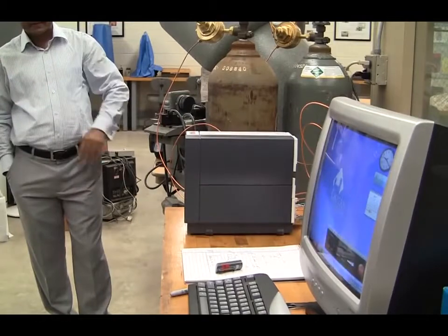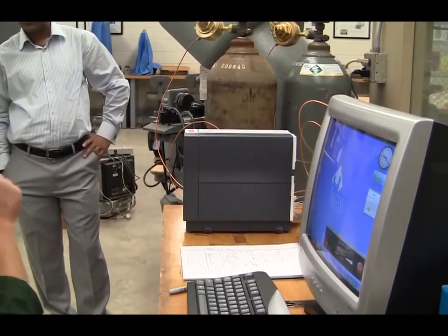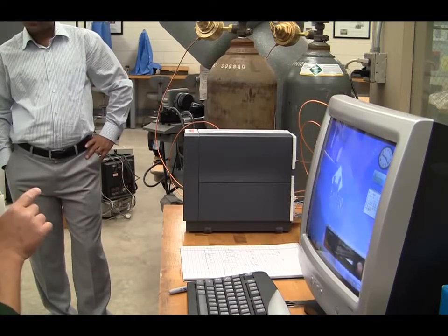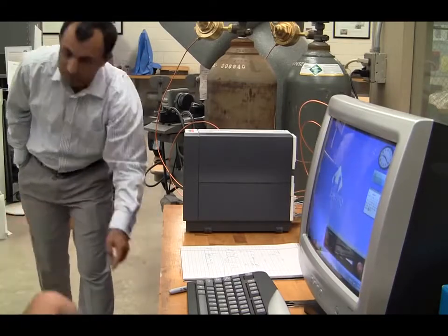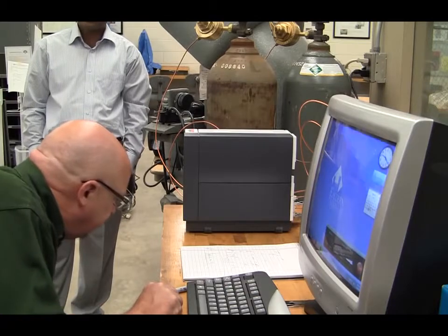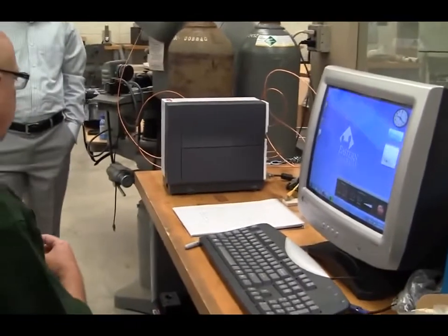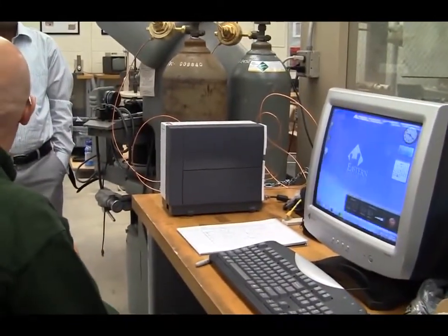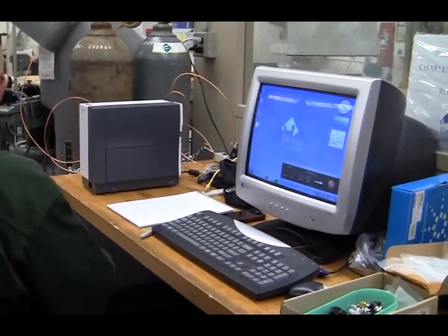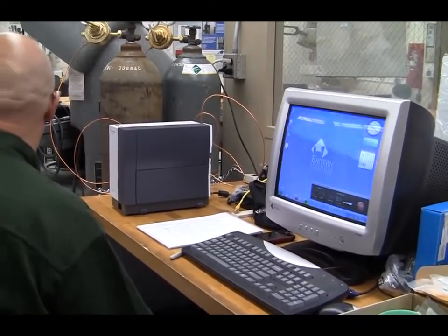So we wait for it to come back to ready. First thing it's going to do is go through the startup. Push that on the stand. Push that. It goes through this Christmas tree lights sequence while it's getting ready. At the end, it'll start flashing 2 green lights. That's when it's in boot P. That's when we can go through and set the IP address on it, and then it'll come to ready.